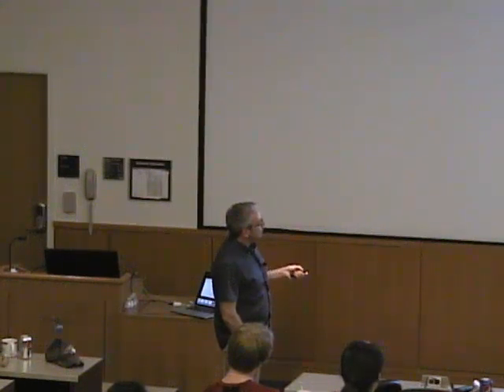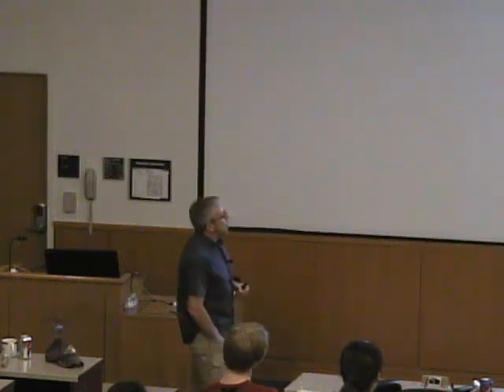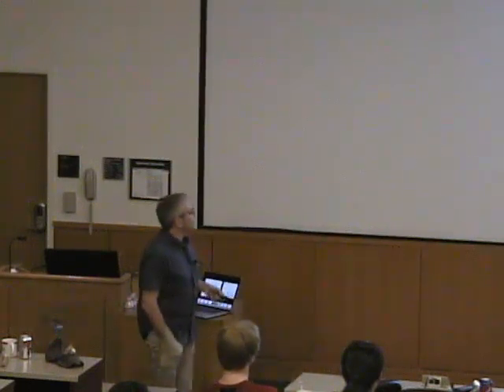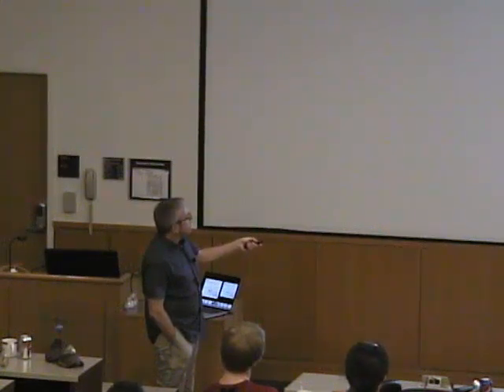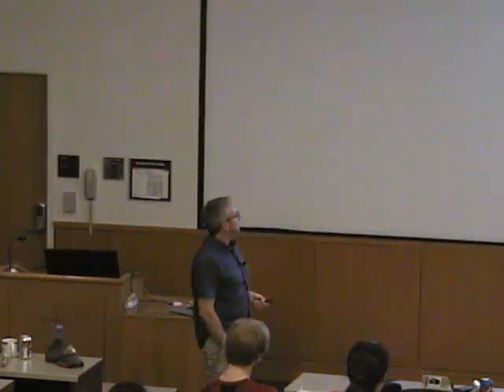We have a right angle here because of the distance of lattice planes. We have a right angle here at the end of the wavefront, and we have a right angle here at the beginning of the wavefront, which means this theta again shows up at this point. Now, we get constructive interference from something like this if the path difference between those 2 waves here, that's the path difference, x, and that's actually easily calculated. It's basically, so x half, this part, is related to the hypotenuse D here, sine theta. So sine theta here will be this divided by that. Okay?